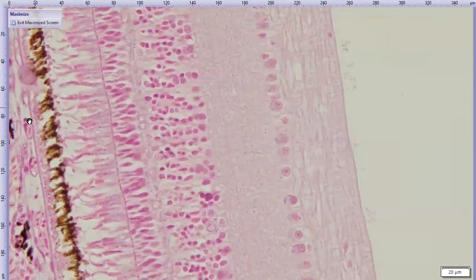So you can kind of get a hint here of the choriocapillaris. I'll show you a better example of that. But it's a capillary network. Once again, the most heavily perfused capillary network in the body. Bird eyes are adapted for visual acuity.